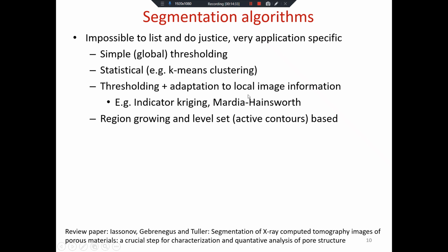And then some sort of local adaptiveness to the image. This local adaptiveness will typically not look at just the value itself, or it will maybe start from certain thresholding values and then adapt from there. Often it's looked at as looking at the gradients of the image and making local decisions based on the gradients, as well as what would the probability be for my pixel to be of this or that value depending on the neighbors.